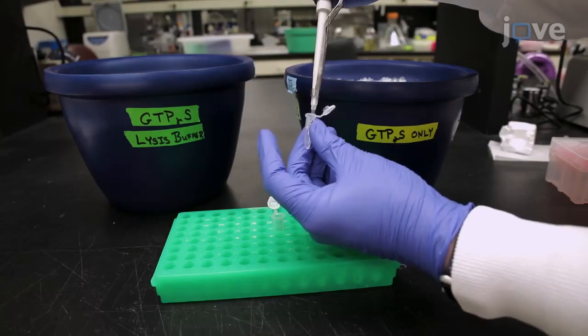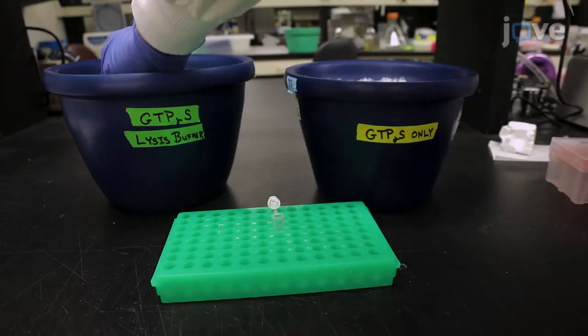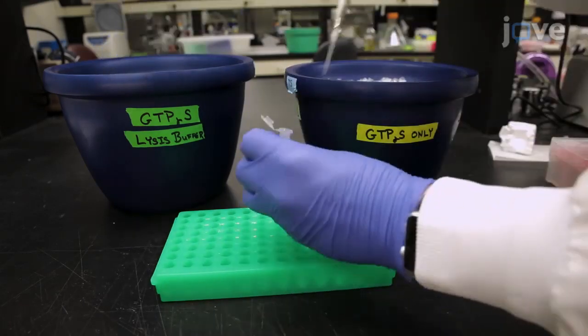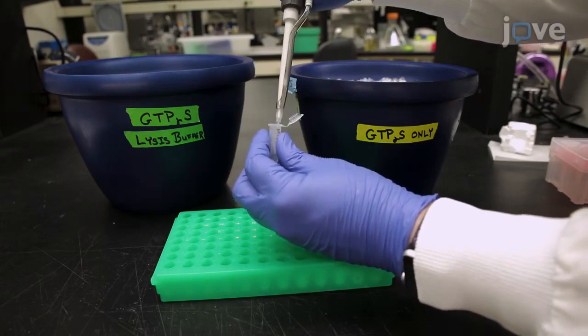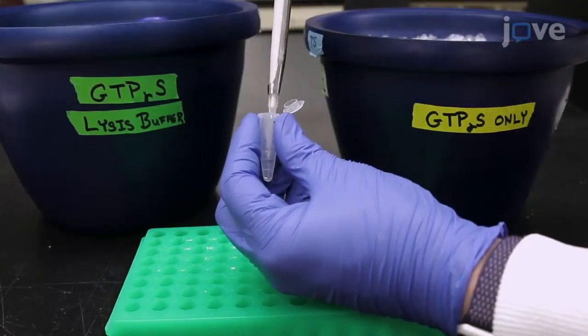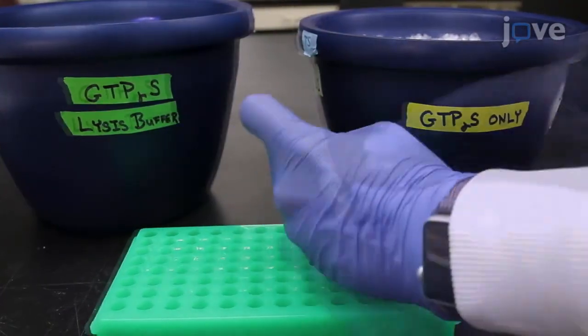To the GTP-γ-S only tube, add 2.7 microliters of 2.5 millimolar GTP-γ-S and 2.7 microliters of lysis buffer. Flick this tube to mix and immediately place it on ice.